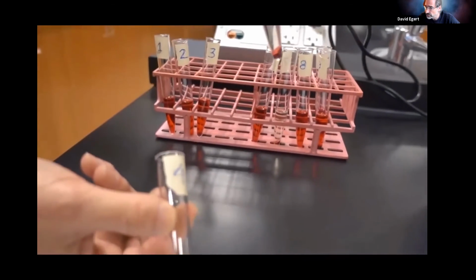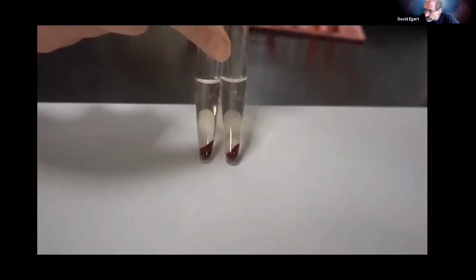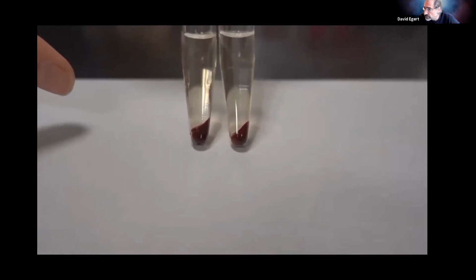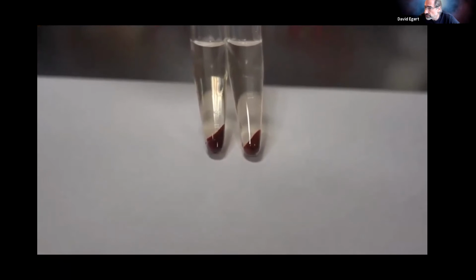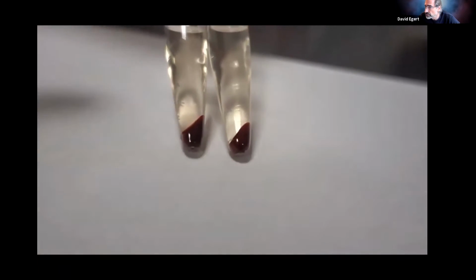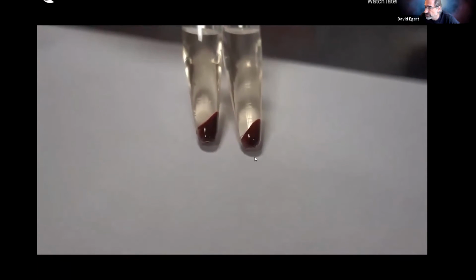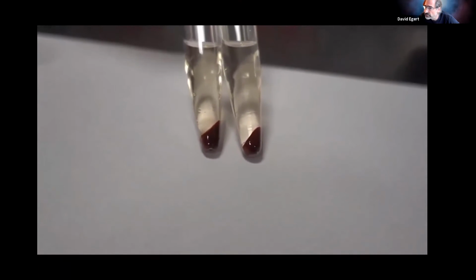This is the 0.6 osmolar solution, the really hypertonic solution. And here we see also the cells are intact, no cells exploded, but I don't know if you can see from your point of view there? I can see a pretty different size in the pellets. As when I was talking about the raisins, think about the grapes. These both have exactly 6 drops of blood, the exact same number of blood cells in them, but the amount of space that those blood cells are taking is different.